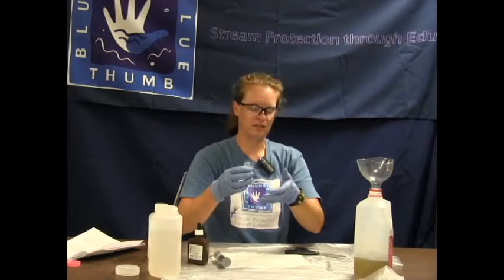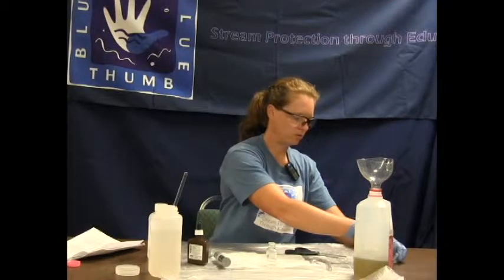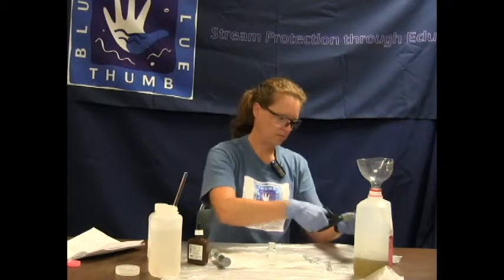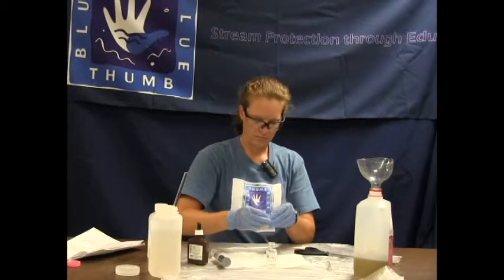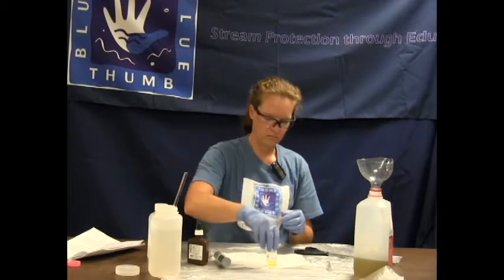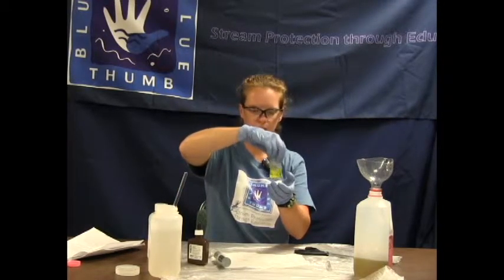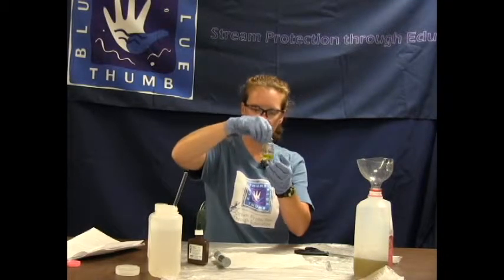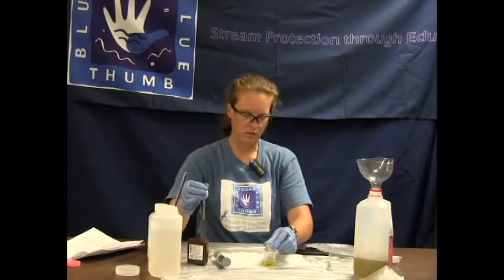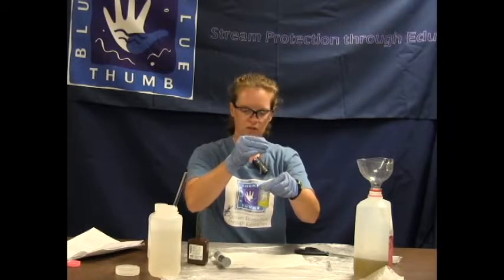The process is the exact same. We are going to add our chloride 2 powder packet to our bottle and swirl to agitate and dissolve. It might take just a little bit longer because there is less solution in here, but it still starts out as yellow. Then you are still going to titrate with the silver nitrate, drop by drop, keeping count of your drops until we get a color change that stays.